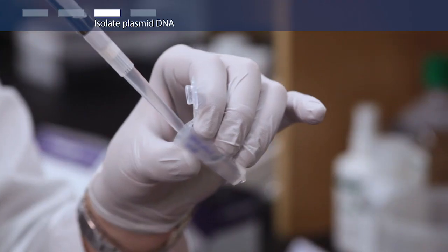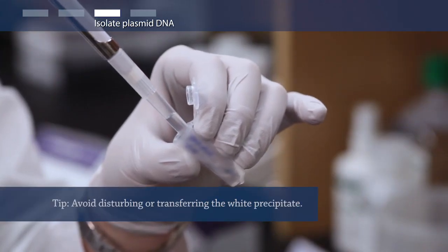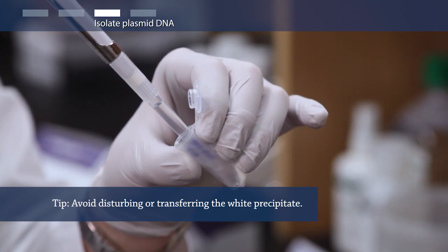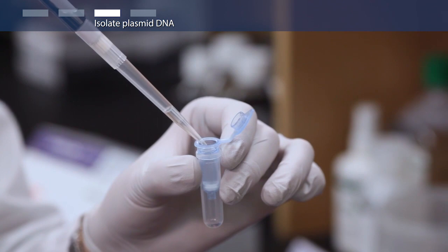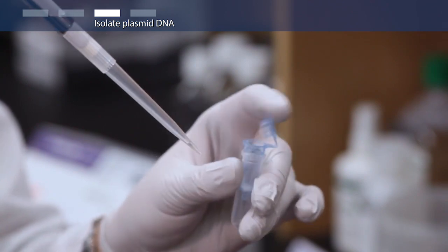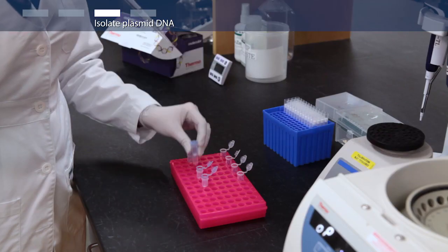Transfer the supernatant, which contains your plasmid DNA, to the gene jet spin column by decanting or pipetting. Centrifuge for one minute. Discard the flow-through and place the column back into the same collection tube.